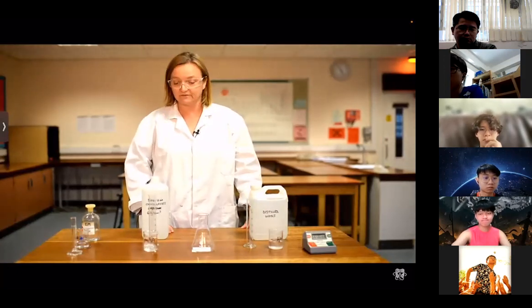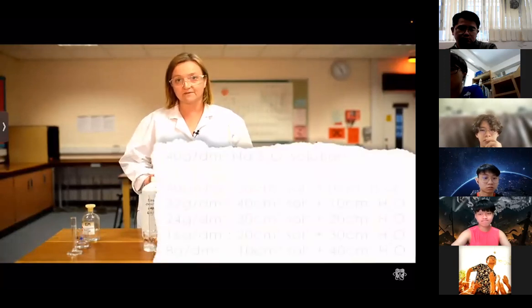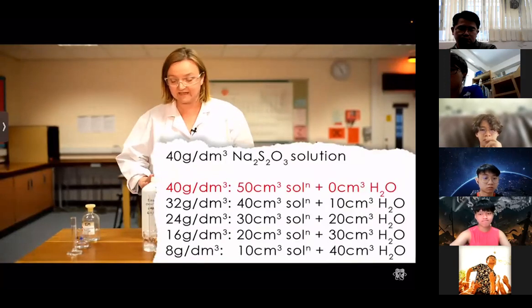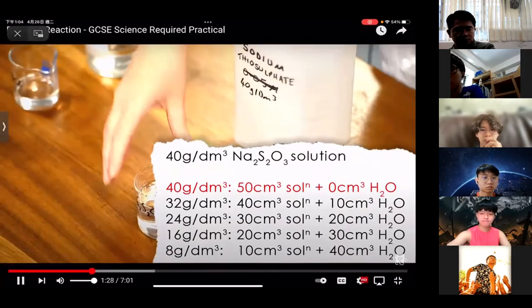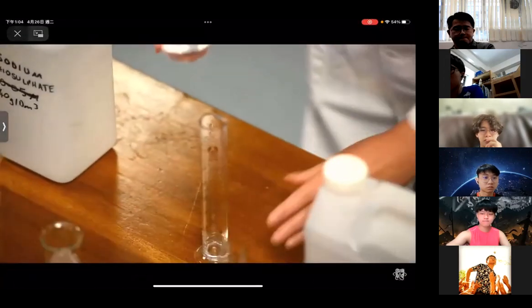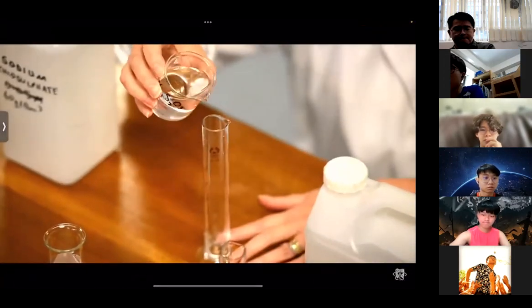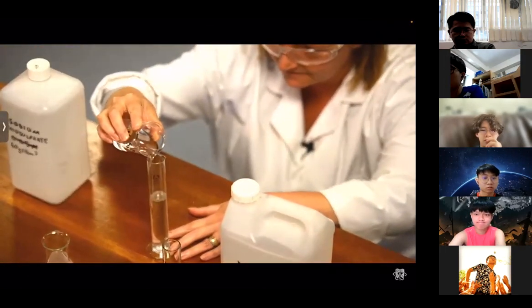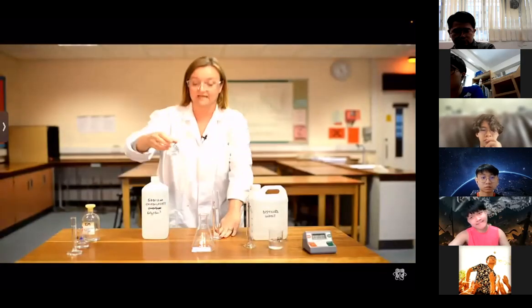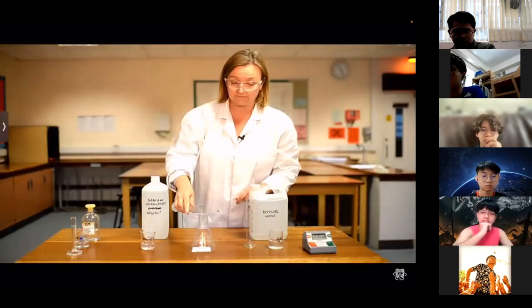To start with, I'm going to go for the most concentrated sodium thiosulfate, which is 40 grams per decimetre cubed, as it comes out of the container here. I'm going to measure out 50 centimetres cubed of this into my measuring cylinder. As before, getting down to eye level so I can see the level of the sodium thiosulfate, I fill up my measuring cylinder. Almost there, a little bit more until I've got exactly 50 centimetres cubed measured out, and I'm going to pour that into the beaker.